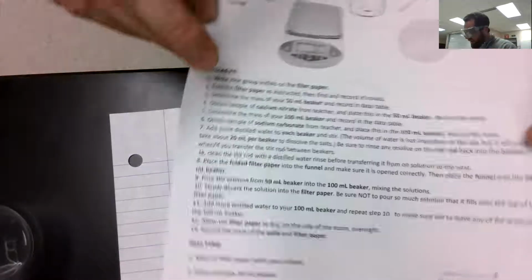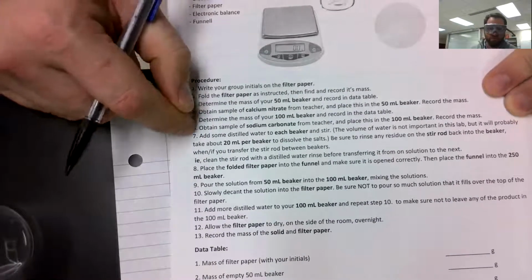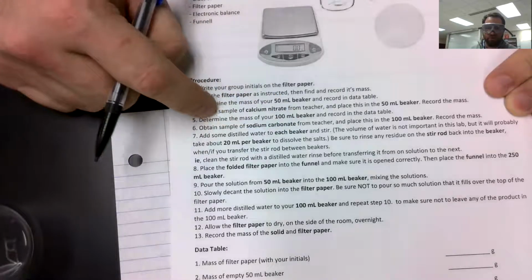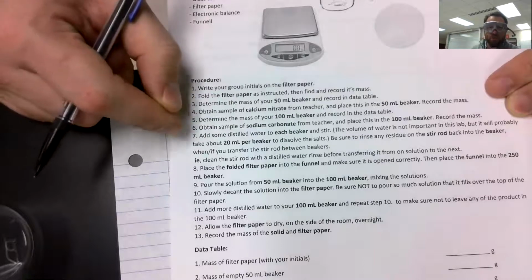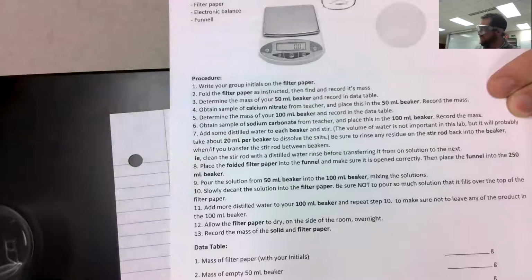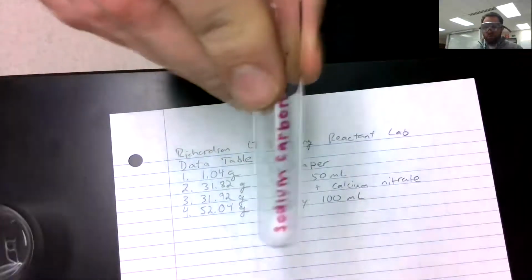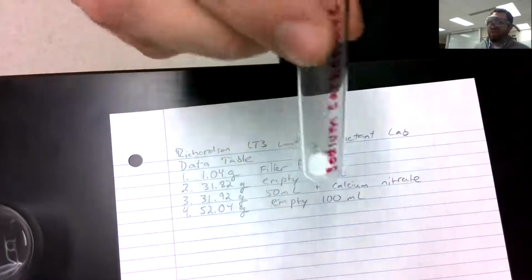Okay, let's see here. We determined the mass of our 100 milliliter beaker. That was step 5. So now we're on to step 6. Now we need a sample of sodium carbonate. We'll add this to our 100 milliliter beaker. Cool. So here's our sodium carbonate. Again, it's a white salt. It looks really similar to all the rest of them. There's a lot of white salts out there.